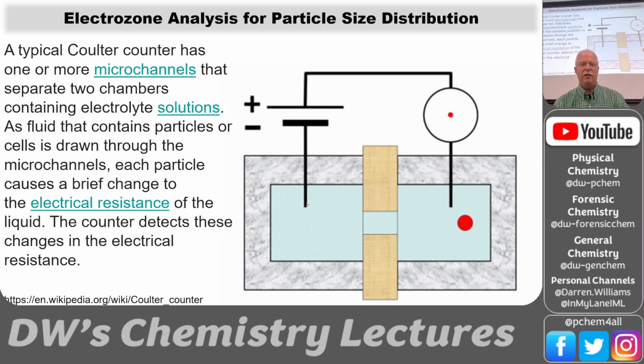So it's got a little voltage put through this salt solution, so electrolyte. And so it can set up a little bit of a potential here, and then you've got this non-conductive barrier, this insulator, and the particles pass through, and when they get into those holes, they sort of create a resistor based on the size of the particle.